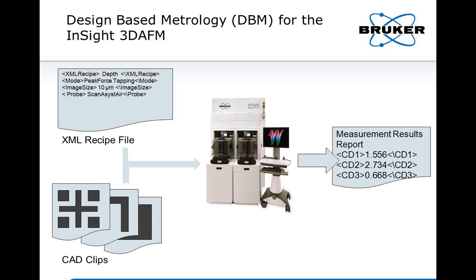To that end, an XML-based recipe format for recipe generation has been developed. All of the design data, references to CAD Clips, and scan parameter information required to generate a recipe for the AFM is contained within this XML file. This XML file is easily edited and modified for rapid recipe development and ease of use.